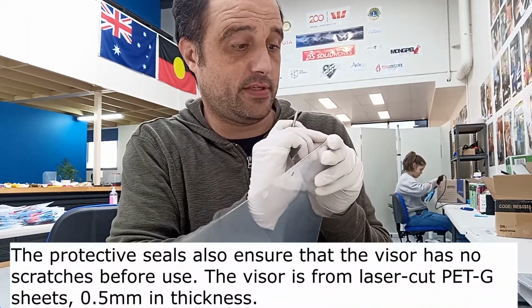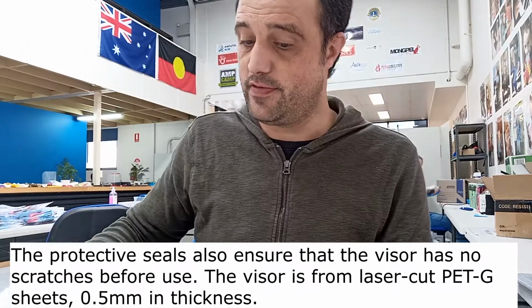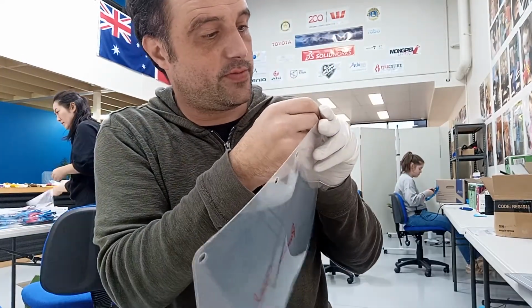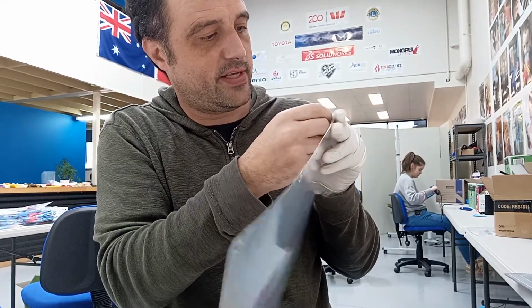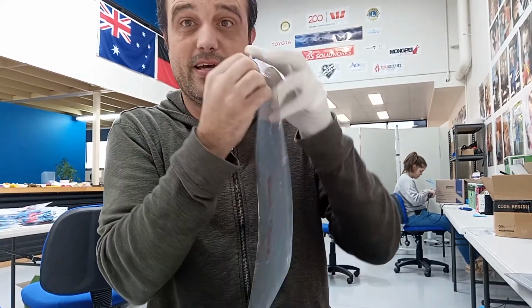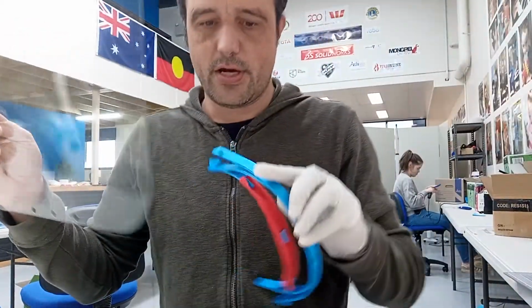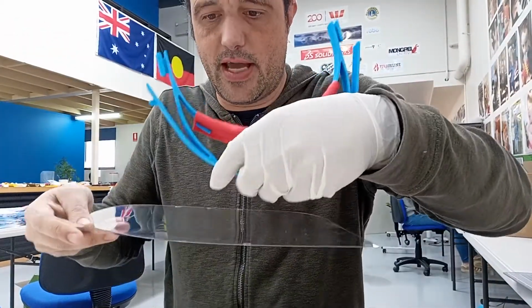Really hard in gloves. Might remove this. This is my own face shield, so I'm just going to use my nail. It should come off easily. There we go. And the second layer is off. Hallelujah. So as you can see now, it's very, very clear without the protective layer on it. So to assemble it, let's just get the angles right.